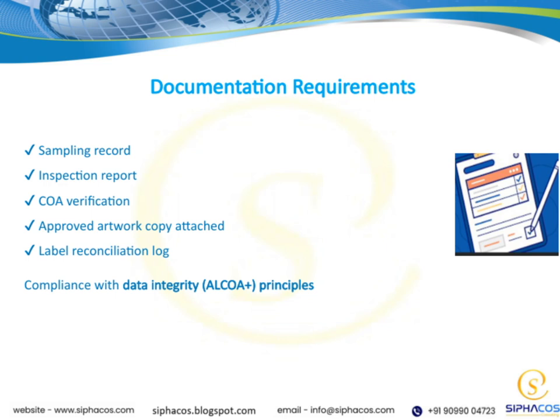All of these documents are integral to maintaining compliance with data integrity principles, specifically ALCOA+, which emphasizes that data must be attributable, legible, contemporaneous, original, accurate, and complete. Ensuring these records are thorough and reliable supports overall quality and regulatory compliance. Remember, good documentation isn't just about meeting requirements. It's about fostering trust in our data and processes.